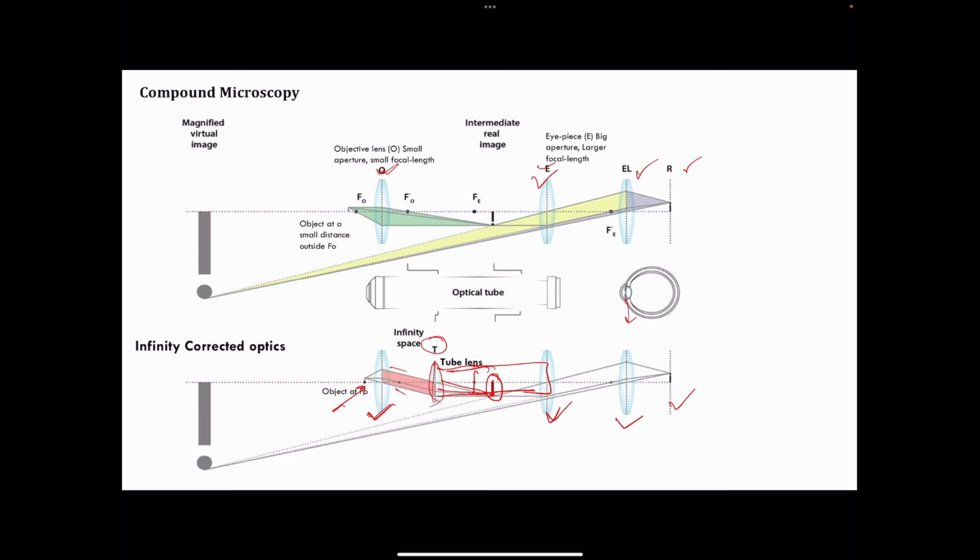However, in this case where you will be putting additional filters, you can actually modulate how you see the image and what you see, in order to do a specific kind of light microscopy. Such microscopy techniques include phase contrast microscopy, differential interference contrast microscopy, or fluorescence microscopy, in cases where you need to use some phase shifters or polarizers or specific color filters which will be responsible for the imaging that you need to do for a particular kind of microscopy.